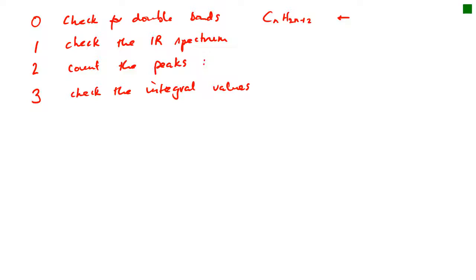And when you get all whole numbers, then you're going to count them and compare to the number of hydrogens in the molecule. All right, so you're probably given a formula of the molecule to work out its structure, so you'll be given the number of hydrogens in the molecule. And so then you want to count the number of hydrogens you've worked out from your integral values to make sure they're the same. So I'll just complete that sentence by saying in the molecule that's in the question.